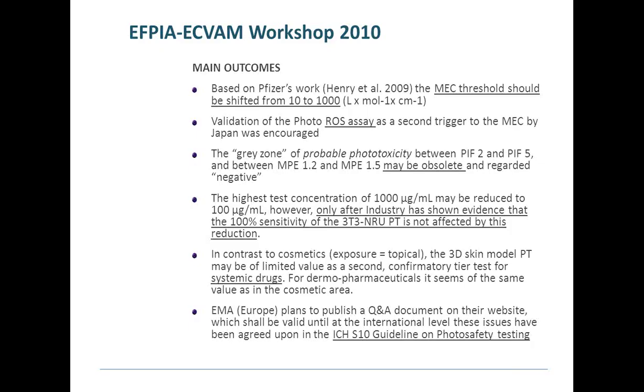Obviously, with all mechanisms some ROS is always generated, and therefore the Japanese were encouraged to perform their formal validation study and to probably get this into the ICH guidance.